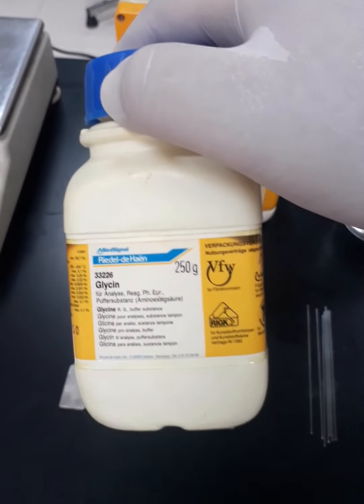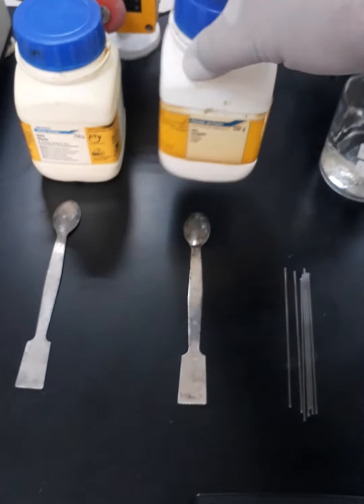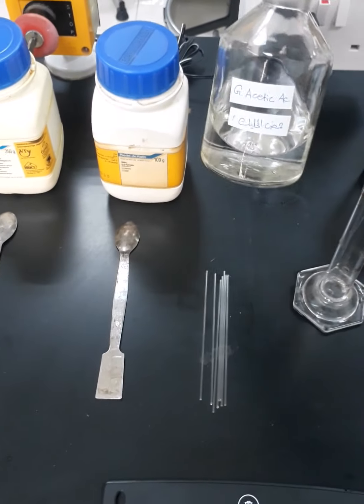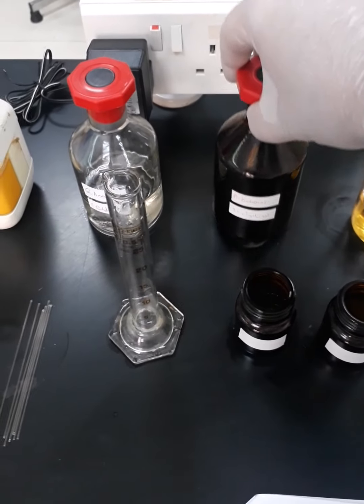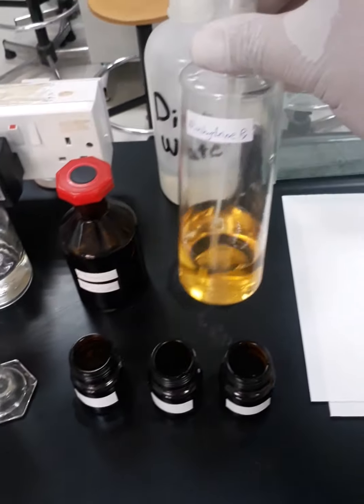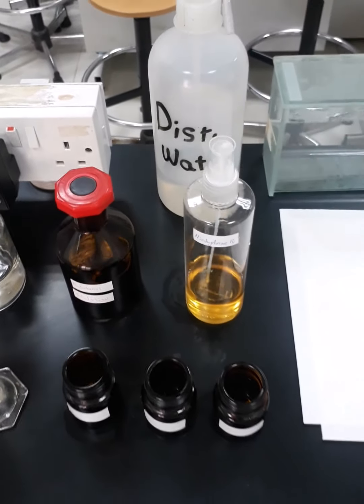And for the chemicals, this is the glycine, tyrosine powder, glacial acetic acid solution, N-butanol solution, ninhydrin reagent in sprayer, and distilled water in the distilled water dispenser.